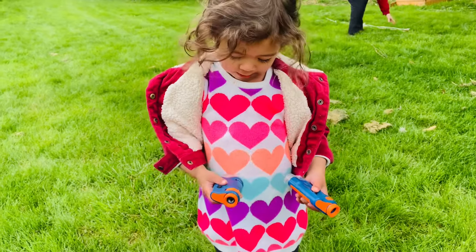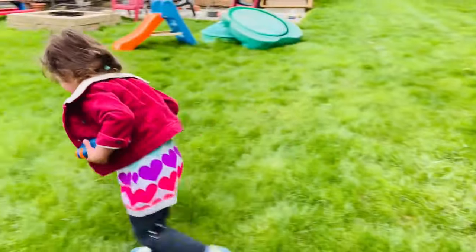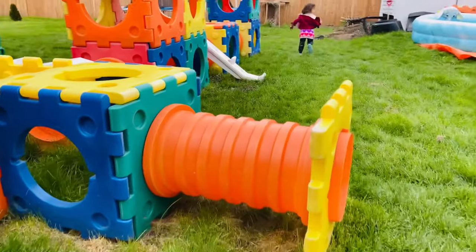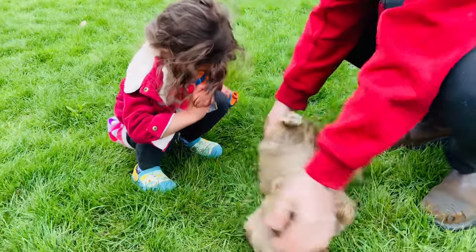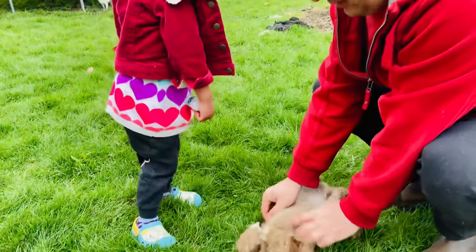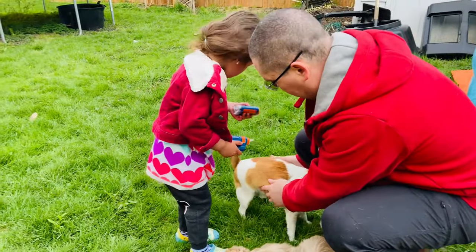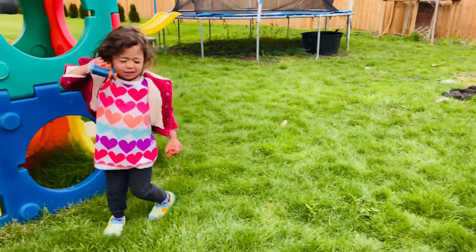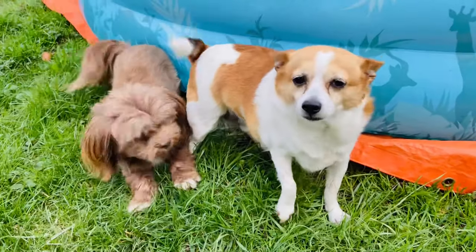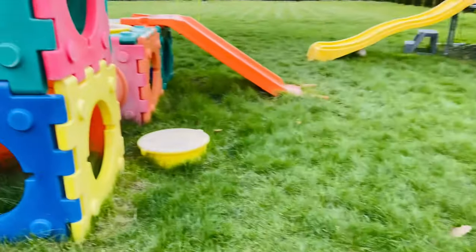Okay, we're going to see the bugs now! There are lots of bugs — let's go! Can you say 'thank you, STEM Kids'? Thank you! Let's go! We're taking a picture with Koda. Come here, sit down, go right here on her fur. Get closer — look at the fur through the microscope! Wow, you see that?